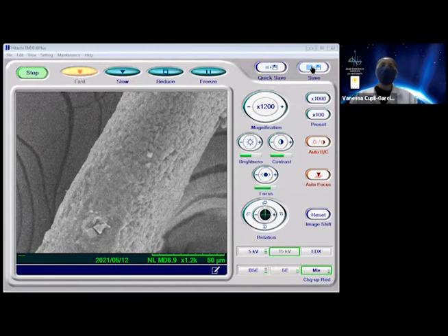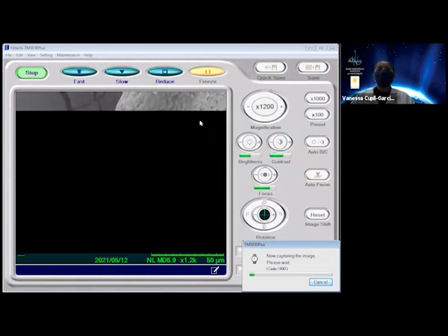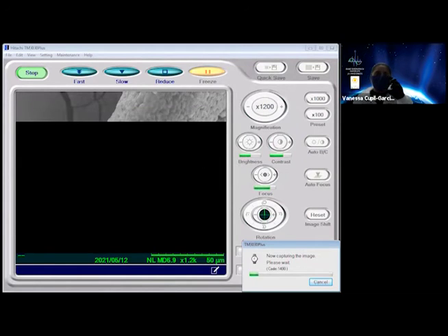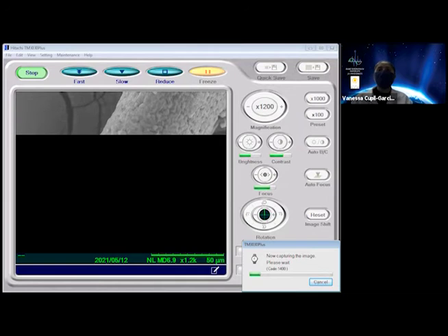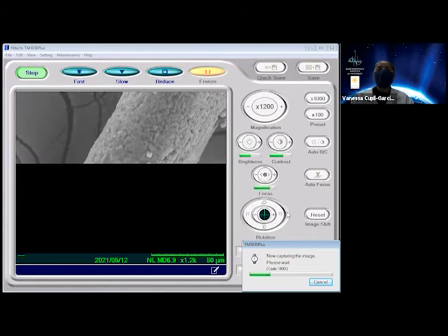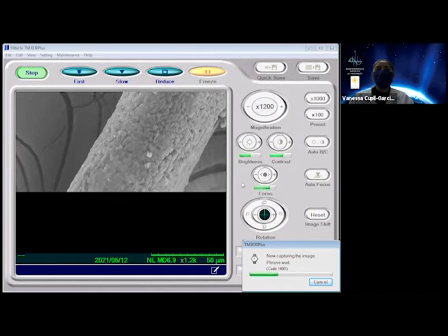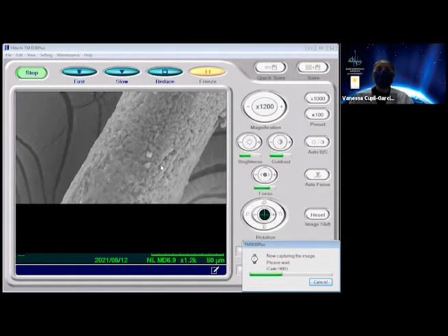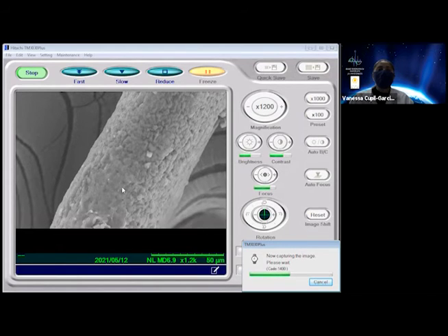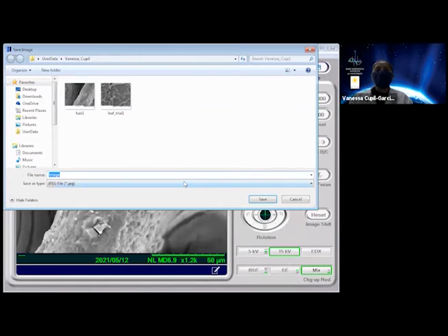And here, the nice thing about the software is that we can also save our images. And so this captures the image kind of like a camera would when you click on the capture button or the take button. So here it's capturing the image. And it looks much better than the live version. And we can see a lot more detailed structure and part of our hair.